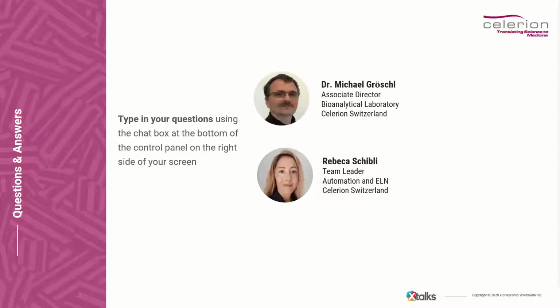Okay, thank you. Here's our next question from our audience member. Is there a recurring challenge that is obstructive for general uses of automation? Yes, definitely to get and to keep the right personnel, because what we described now requires a lot of experience, but also continuous learning, learning from errors and not doing the same errors again, of course.